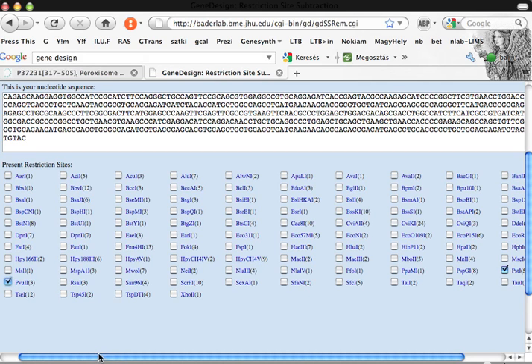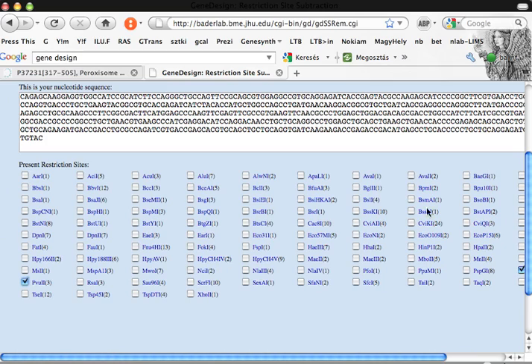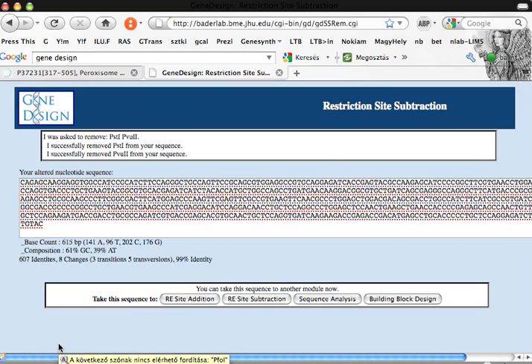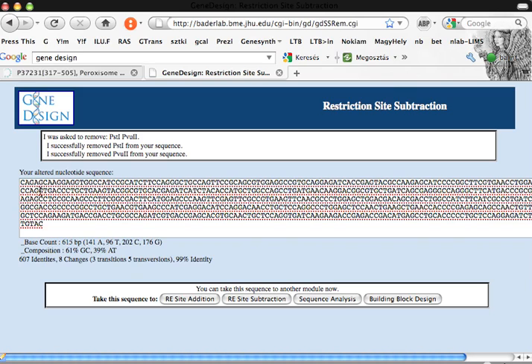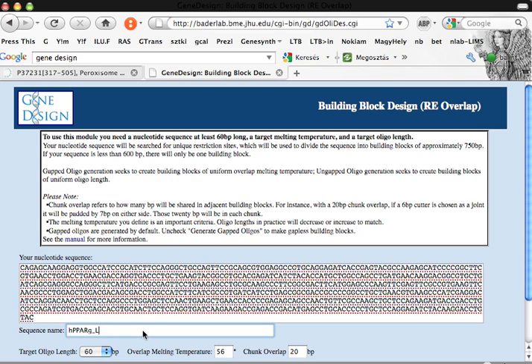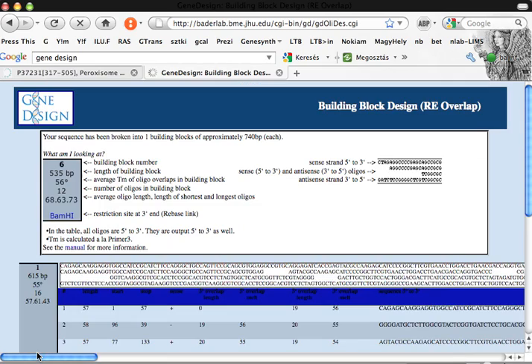What we found is PvuII, 3 sites, and PstI, 5 sites. Let's press to remove these sites and what we got is the sequence of the PPAR Gamma LBD. So let's go to building block design. Right here, PPAR Gamma human PPAR Gamma LBD.